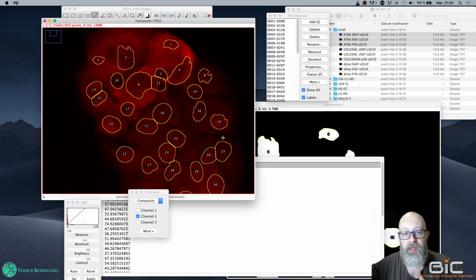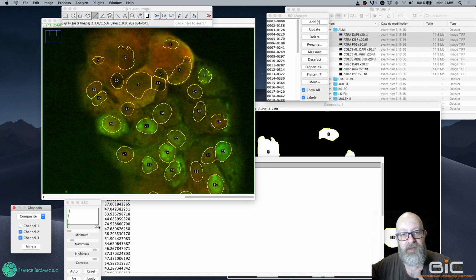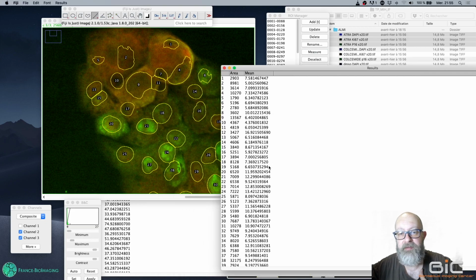Now, I will move to the third channel that is not displayed because I unticked it. So this is the third channel, and now the thing I can do is measure. Same, I've got intensities.